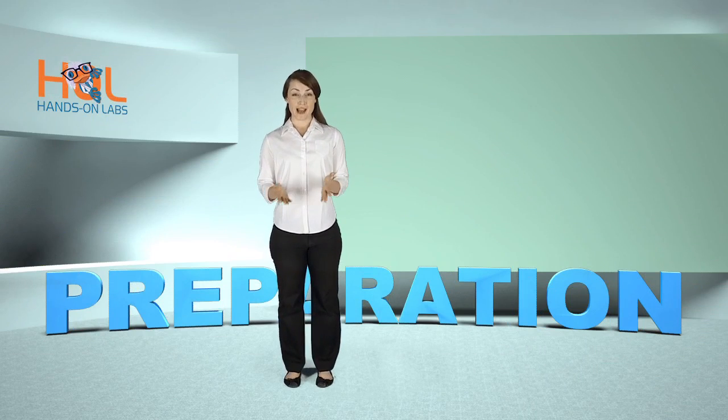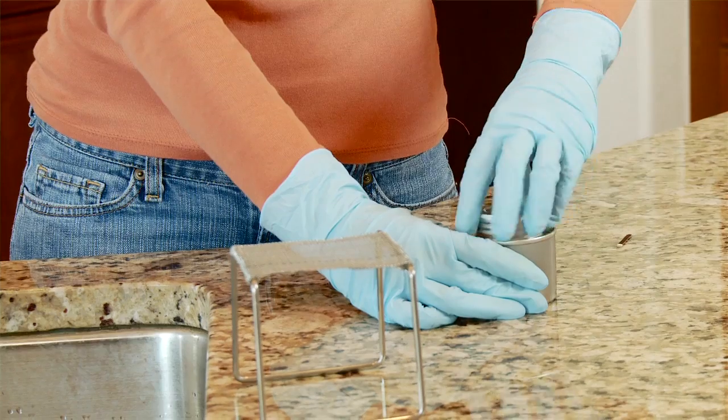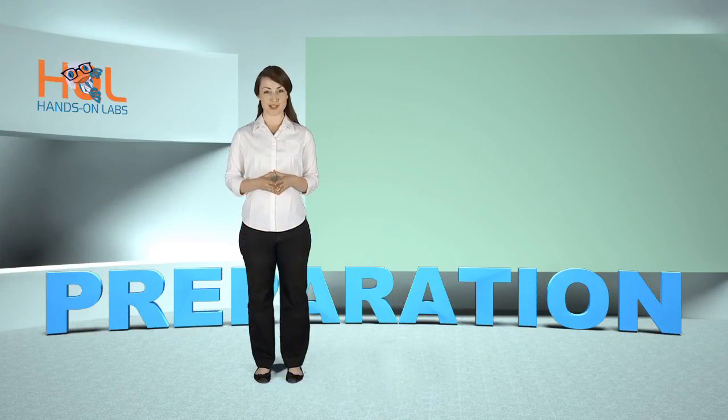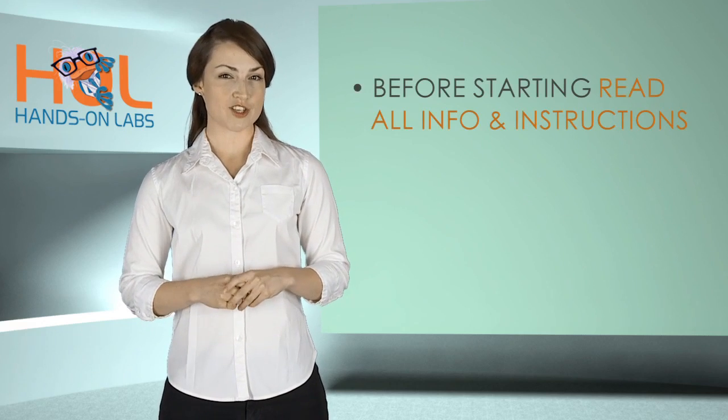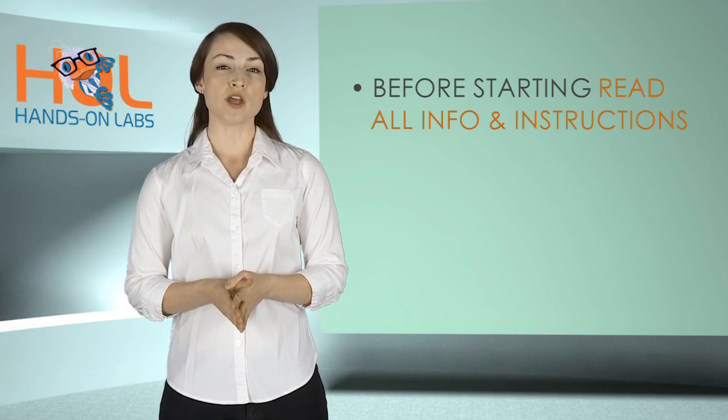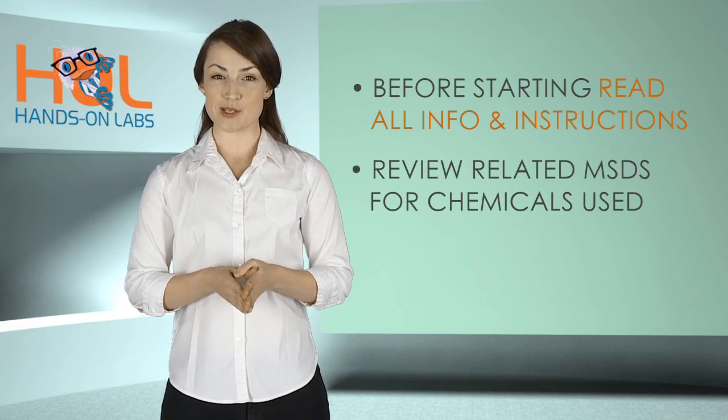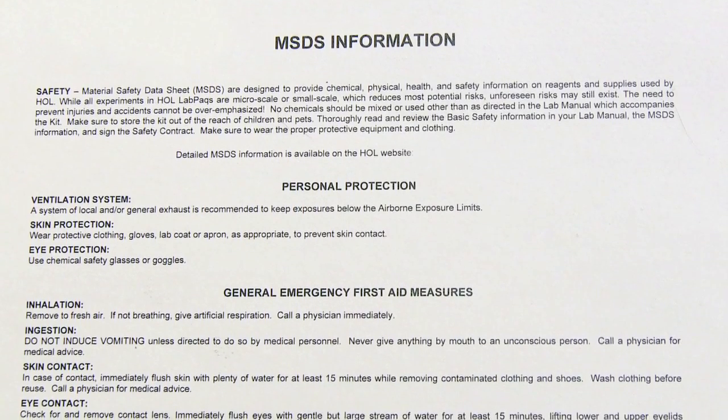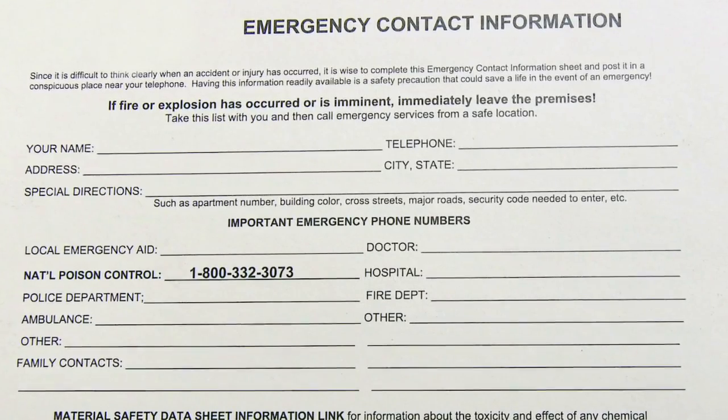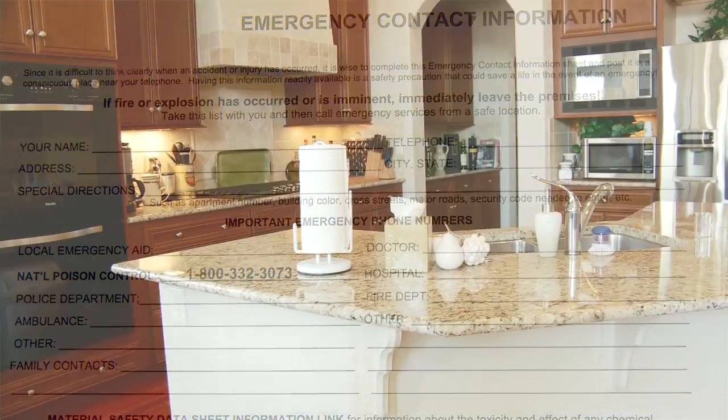The prep phase of your at-home lab work requires gathering, organizing, and preparing all of the materials you will need for your experiment. Here are the steps. Before starting each experiment, read all information and instructions. Review the related material safety data sheets, MSDS, for chemicals used. Complete the emergency contact card and place it near your telephone.